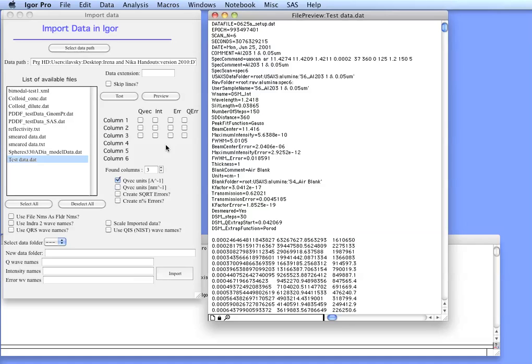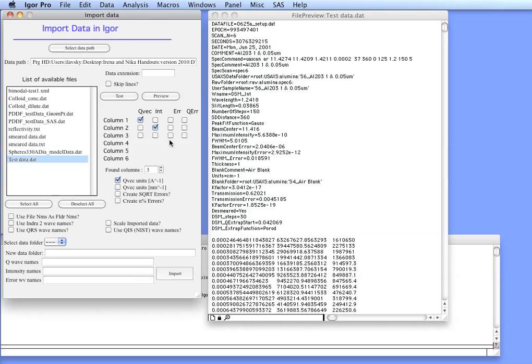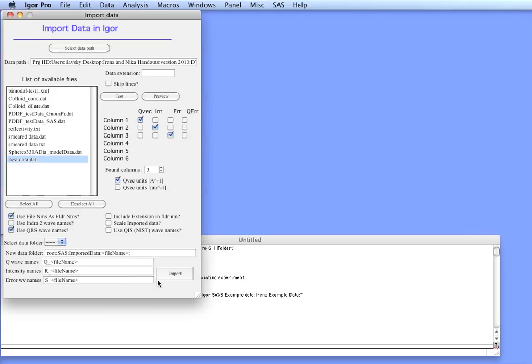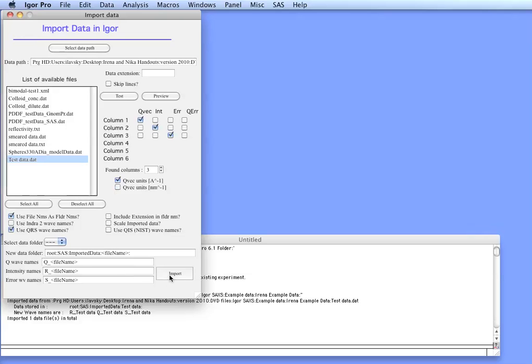The first column is Q, the second is intensity and the third is error. We can also use the file name as a folder name and we will use QRS wavenaming structure. Keep this selected and just hit import.